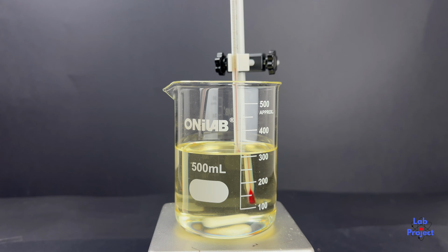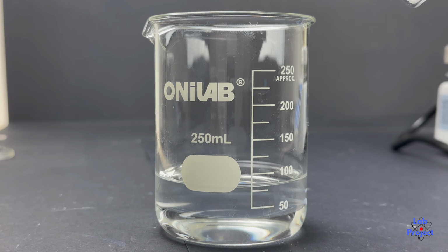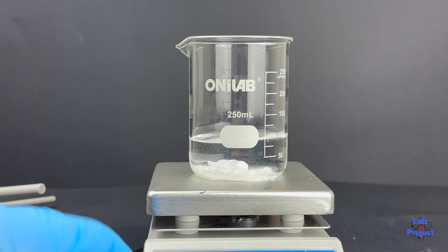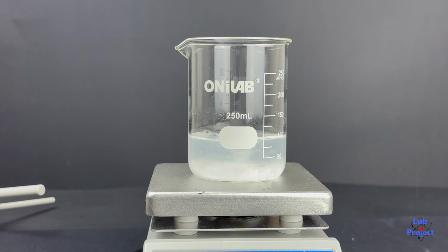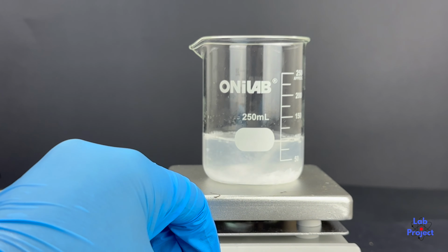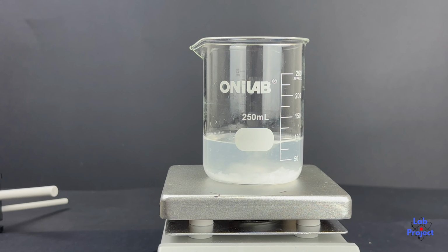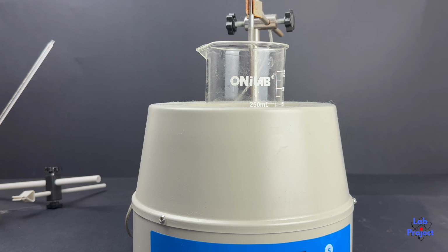After that, I measured 76 milliliters of methanol with a syringe into a beaker and added 5.56 grams of sodium hydroxide. I stirred it on my heating plate to dissolve the sodium hydroxide in methanol, forming methoxide, a much stronger nucleophile. However, I noticed that the hot plate was still too hot after heating the oil. The methanol started to evaporate, and this is a problem because methanol is toxic and not safe to breathe. So I swapped it for my heating mantle and continued stirring.